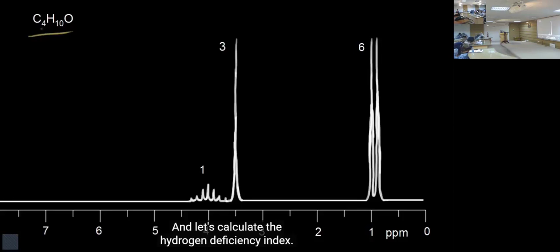I would recommend a picture, a range where the chemical shifts of different groups are mentioned, in the book of NMR spectroscopy by Professor Iqbal Chaudhary and Professor Rahman. So just have a look at this. This is a nice picture that is always helpful.